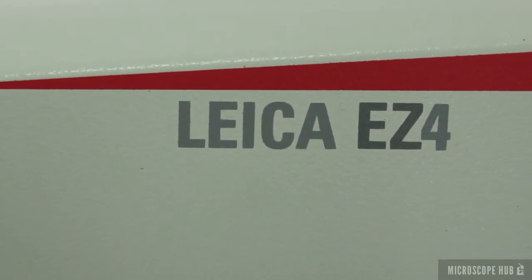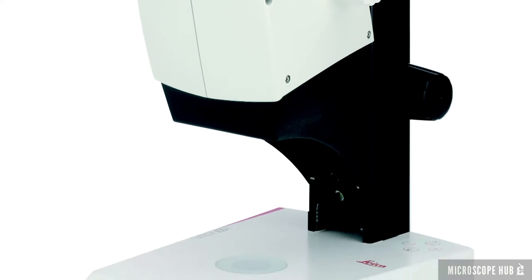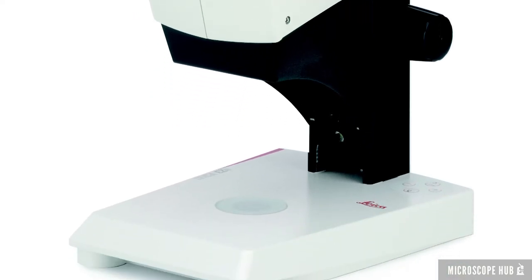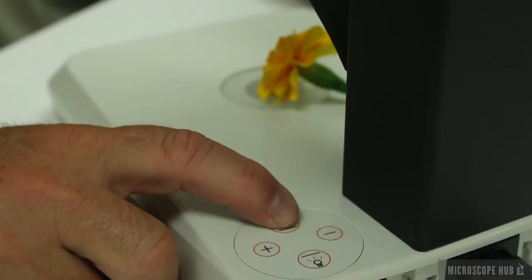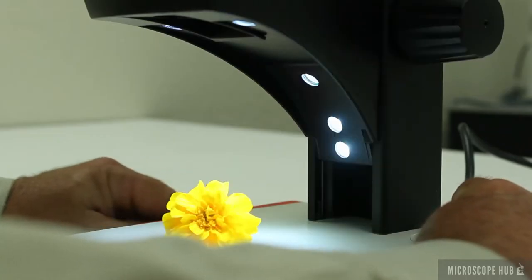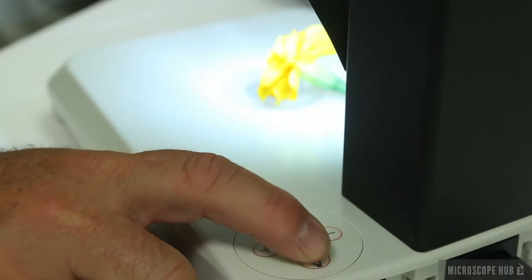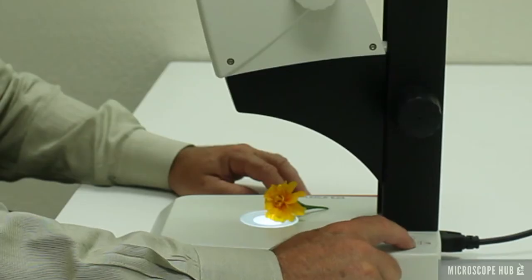The EZ4 Educational Stereo Microscope is the perfect solution for high school and college programs in biology, anatomy, and other sciences. The design features both a transmitted LED light stage and incident LED lights from multiple angles. It offers adjustment control over light direction and light intensity.